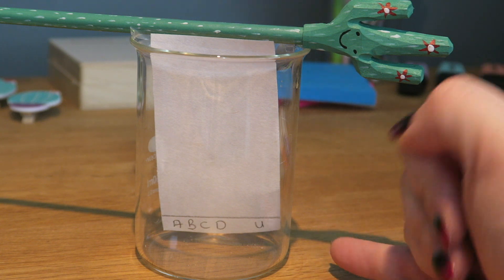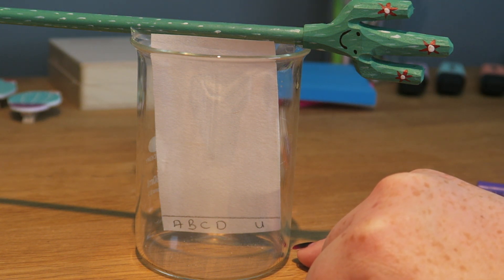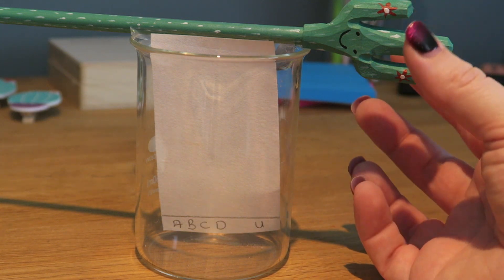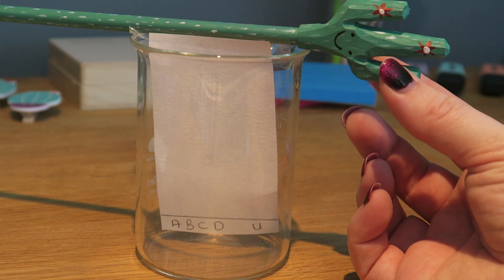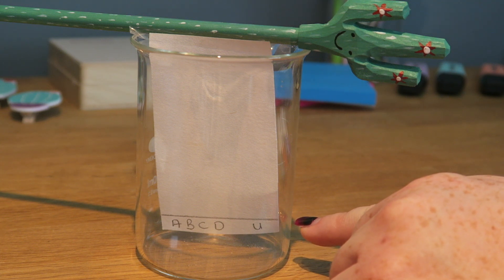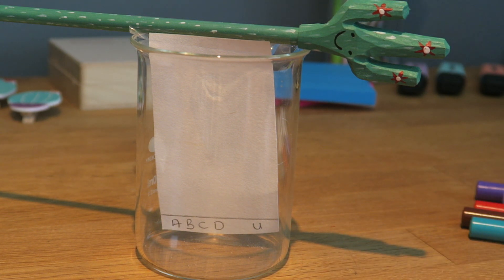If you touch the sides then the solvent, the liquid, the water in the bottom will run up the sides and ruin the experiment. When I put water in it is going to be below the level of the start line. Now I can put my dots on.